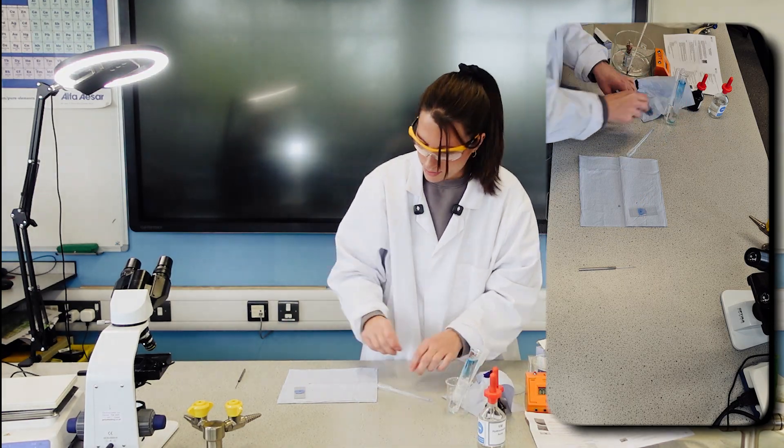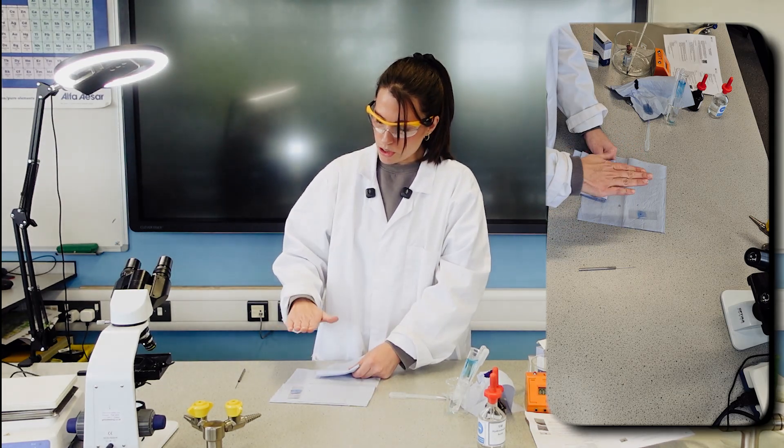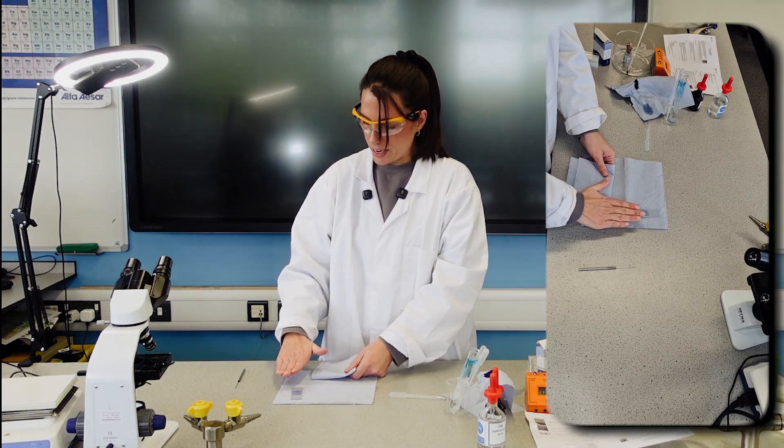Place the cover slip on top. And now this is where we get the squash part. I'm going to put a piece of tissue paper on top.